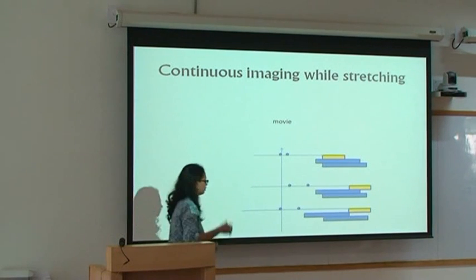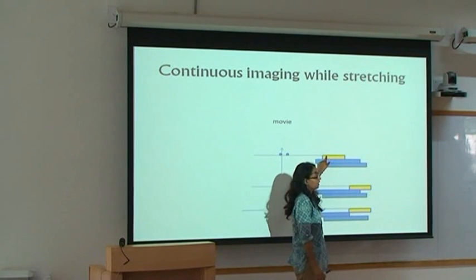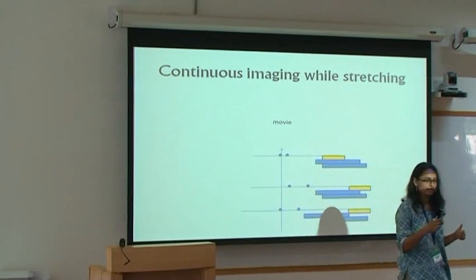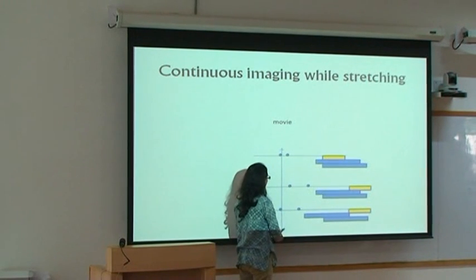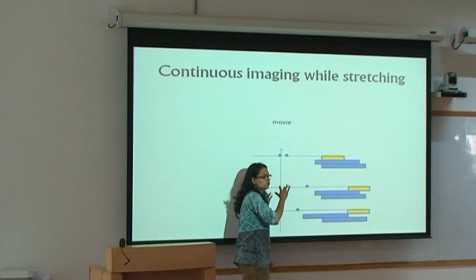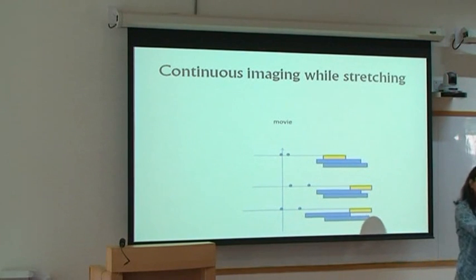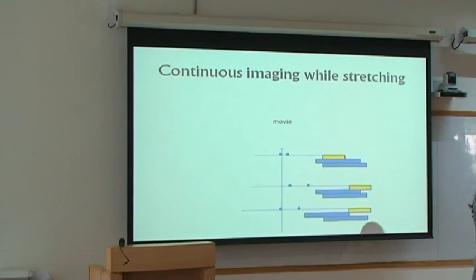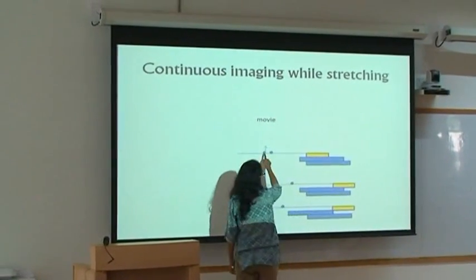Continuous scanning, I think we talked about it, but let's say these are the 2 points. Let's say this is your stretcher, and you need a motorized stage if you want to continuously see it being stretched, and this is why. Let's say these are the 2 cells, and this is the cell you want to study. This is where, let's say, the objective is. They were here. Now you stretch in one direction. It doesn't matter. Even if you were stretching in 2 directions, the only point which will not move from your point of view is the band center. And you will not always come to that. You will like a cell which is nicely fluorescent, with a nice shape, in a completely different position, not at the band center, right?